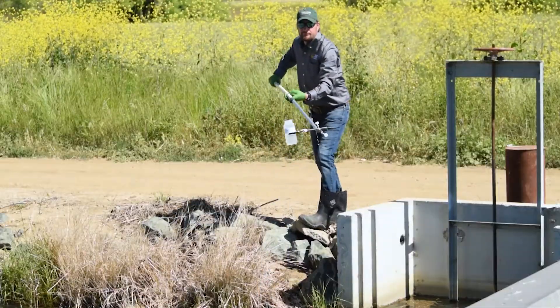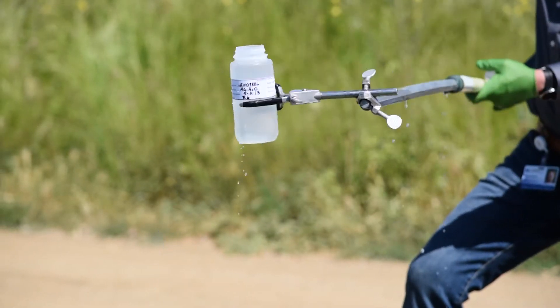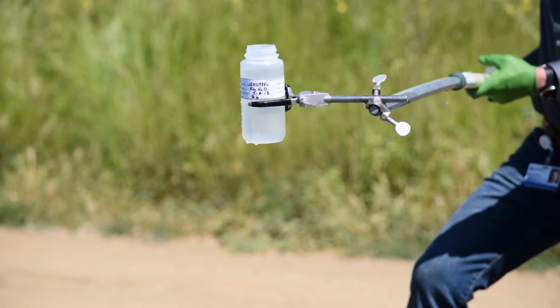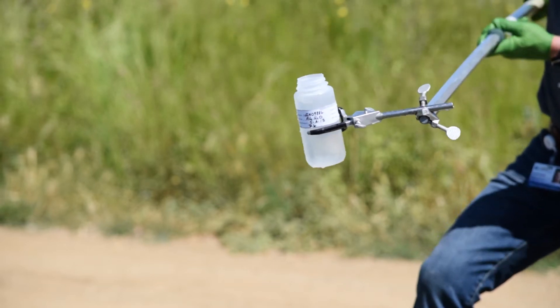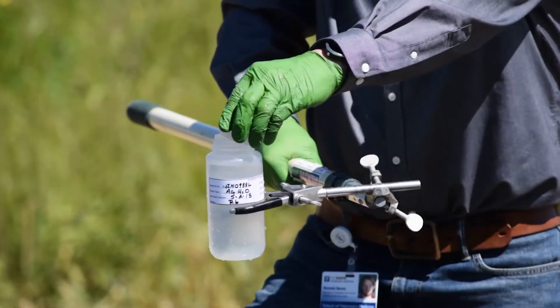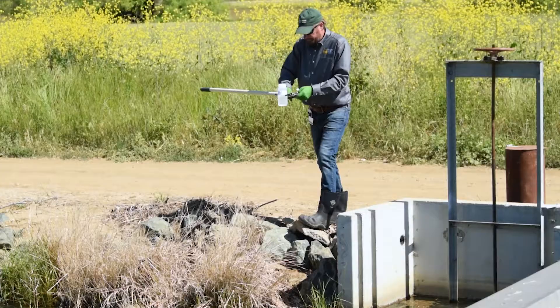Bring the sample container out of the water and hold the sample up to check the volume. If the container is too full, pour some of the water out. The water level should be below the shoulders of the bottle — this leaves space so that the sample doesn't leak when shipped and allows the sample to be mixed properly when processed at the lab. Replace the cap immediately and make sure it is on tight.